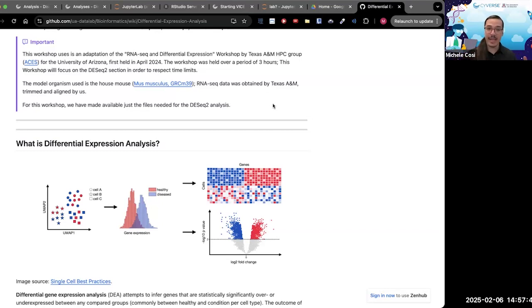We were able to align it to the reference genome of the mouse, and we created a PCA plot. We ran some differential expression analysis. We were able to look at a heat map. We created even an enhanced volcano or a volcano plot that you may be able to now try to create in your own laboratory.